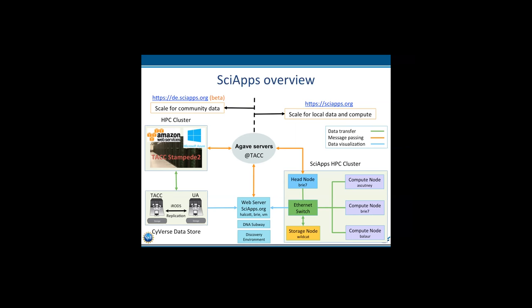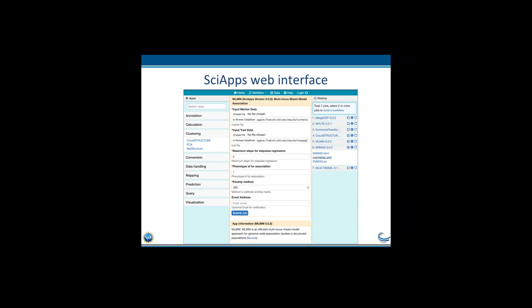de.SciApps.org is the beta version and is pretty stable now. We have several workflows running on that which we can share with you. This is the SciApps web interface. In the center, I loaded an app called MLMM for multi-locus mixed model association — it's one of the modeling tools for GWAS. On the right side is the GWAS workflow; on the left side are the apps. The three panels look similar to Galaxy, but the main advantage is you don't need to install your own Galaxy — all the workflow tools are ready to use.